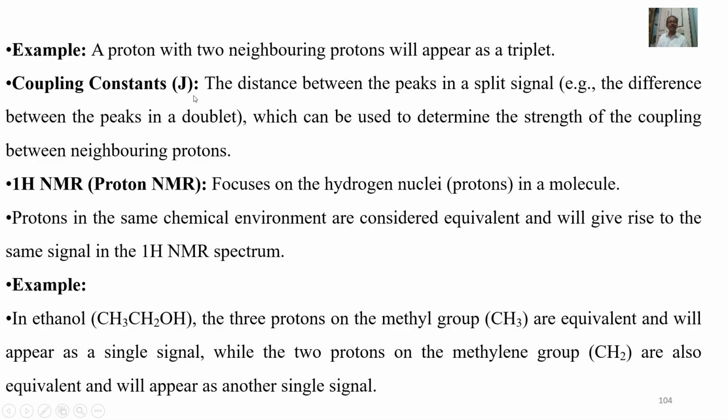Coupling constants J. The distance between the peaks in a split signal, for example, the difference between the peaks in a doublet, can be used to determine the strength of the coupling between neighboring protons.